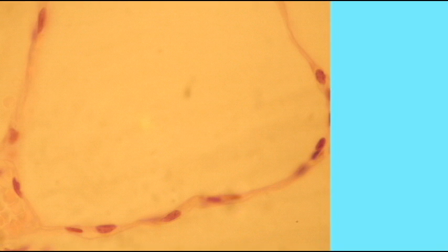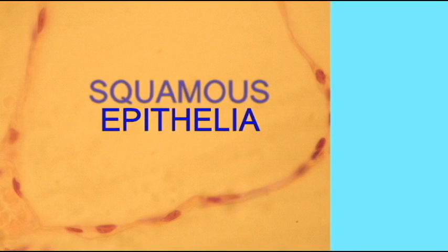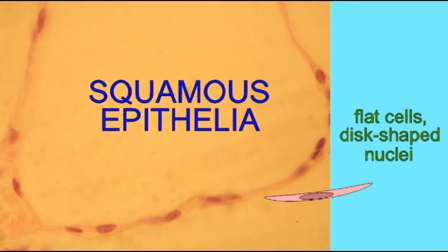This image is of simple squamous epithelia. It can be identified as epithelia because of the spaces around the cells. These are the air sacs of the lungs, and epithelia face the spaces which exit out the body, such as those of the respiratory system. These are squamous cells because of how flat they are.